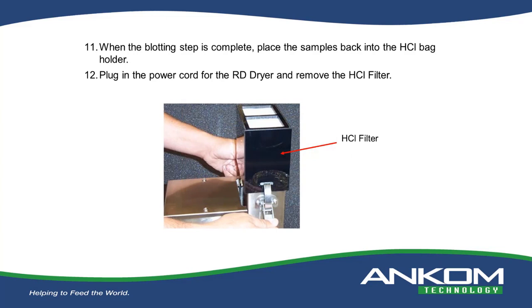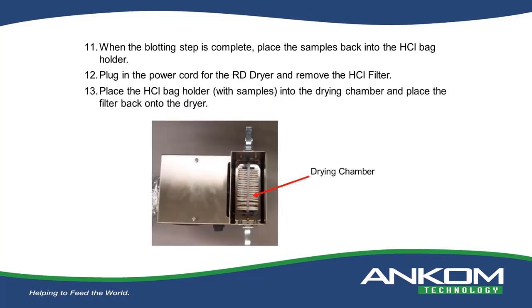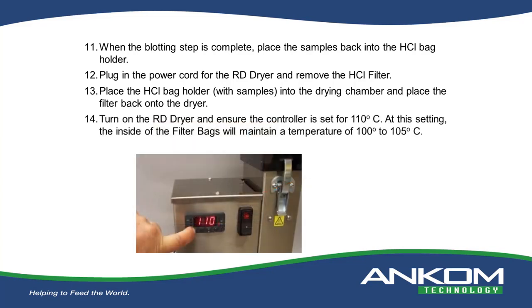Plug in the power cord for the RD dryer and remove the HCl filter, the black filter that you can see here. Place the HCl bag holder with the samples into the drying chamber and place the filter onto the dryer. And here this picture is taken from the top of the dryer without the filter. You can see the drying chamber with the 15 bags in the bag holder sitting in the drying chamber. Turn on the RD dryer and ensure the controller is set for 110 degrees C. With this setting, the inside of the filter bags will maintain a temperature of 100 to 105 degrees.